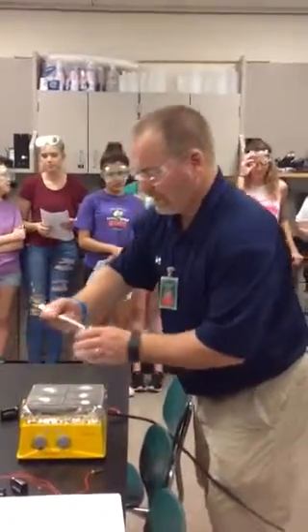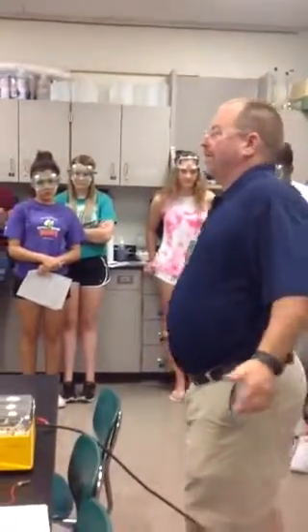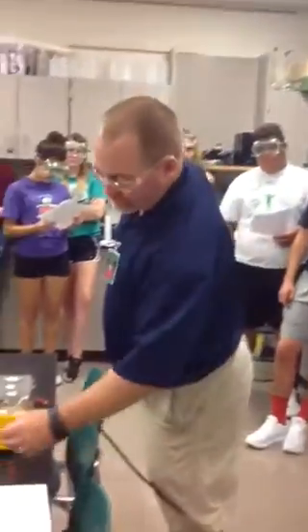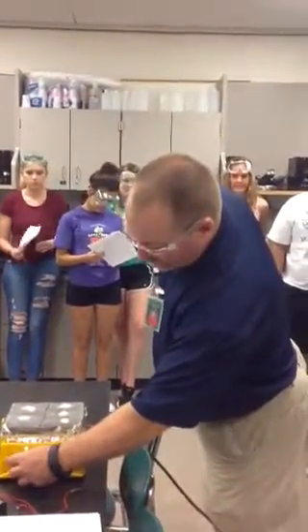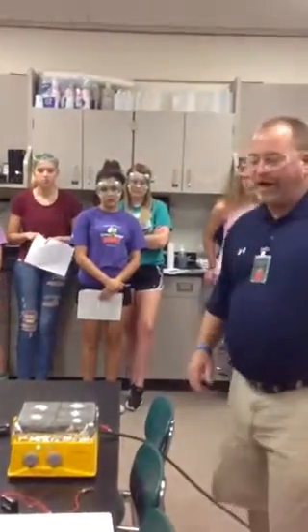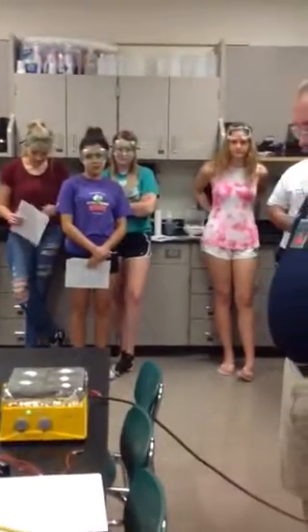Now you guys probably don't have a very good view of these. You're going to have to write down the description of them. So when you're picking them up later on to do your part of the lab, the solubility and the conductivity, make sure that you write down what the description is. All I'm simply going to do is turn the heat on to about 5, and we're just going to sit and watch to see if anything happens with this.